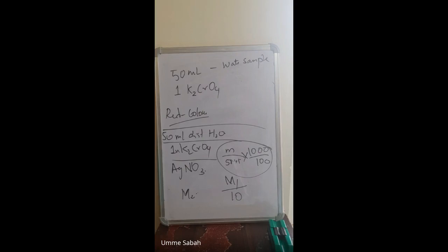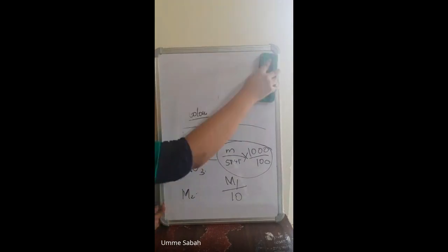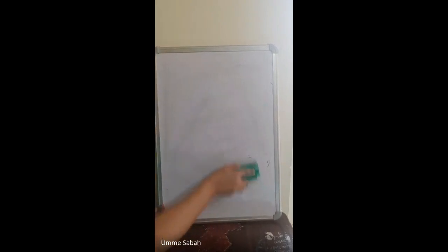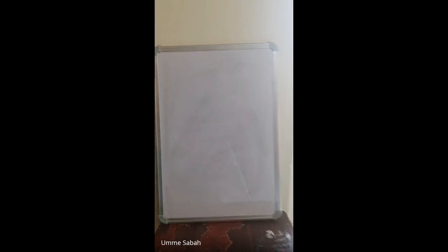All right. So here, this is your 9th experiment, which is a performing experiment from your practical number 12. I told you what the experiments are for your practical number 12. Coming from 1 to 10, experiment 3, experiment 6 and experiment 10 are the demo experiments, whereas the remaining experiments are all performing experiments since they are all volumetric titrations.